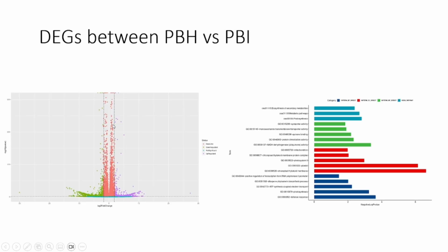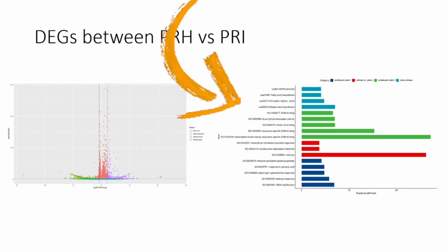Okay. Then you have to see the volcano plots, which show how your genes were regulated. For example, see, up to minus 15 my genes were downregulated, up to 12 upregulated, and these many genes were in the base. Like that, you have to check the expression pattern of your genes in the sample under a particular treatment. Then I told you how you can generate gene ontology plots like this.